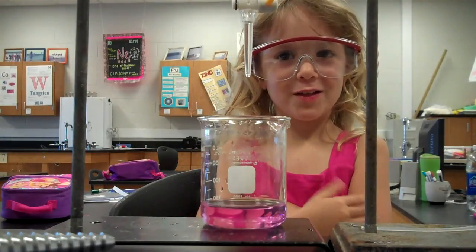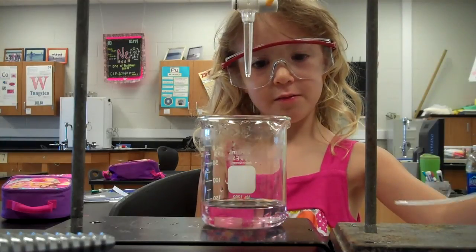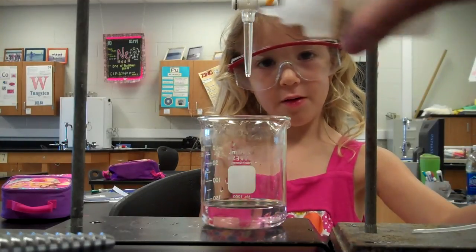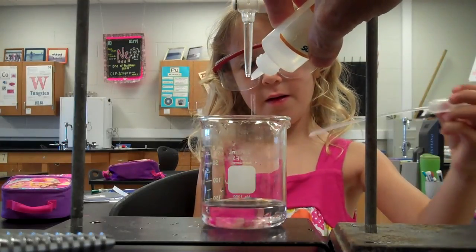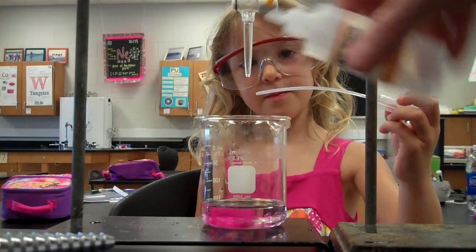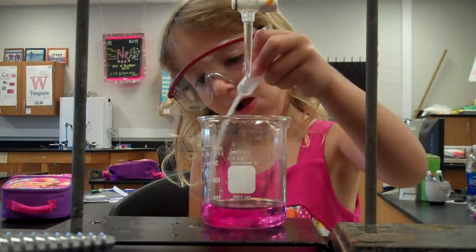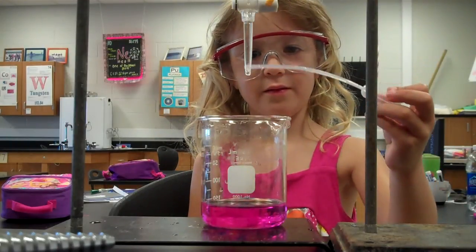Do you think you can turn it back for us again? It's already turning. Try to mix it — let's see what we get. It means it's almost neutral. Mix, try to mix it. All right. Now it's below seven.